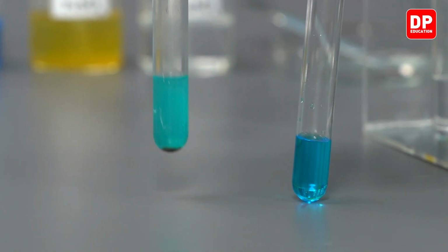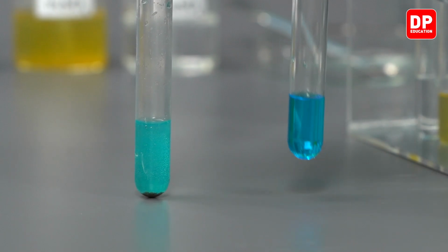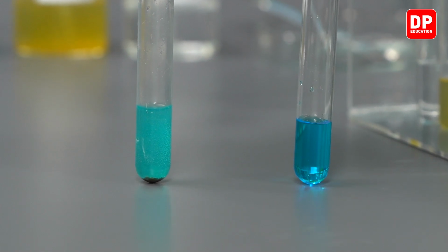What we have over here is the copper sulfate solution added with lead metal, and what we have over here is copper sulfate that was not added with anything else. So you can very clearly see a color change.